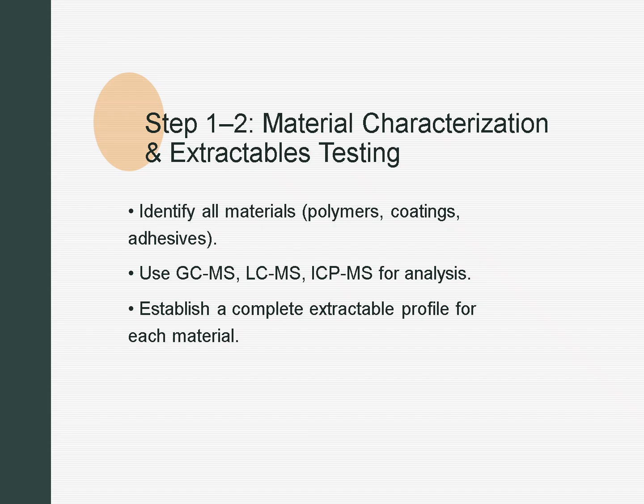Once that's clear, we perform extractables testing. This is where we intentionally push materials under extreme conditions to uncover what they might release. Using techniques like GC-MS, LC-MS, and ICP-MS, we create a complete chemical fingerprint, identifying everything from volatile organics to trace metals. This forms the baseline for understanding what could potentially leach into a patient's body.